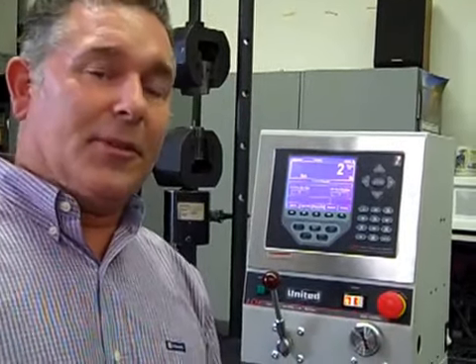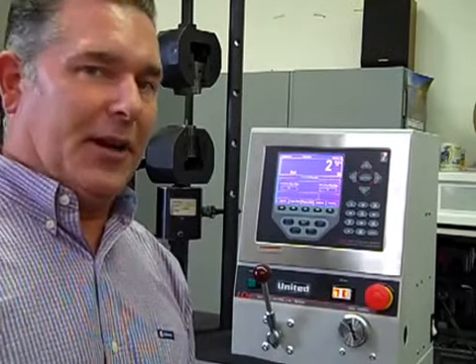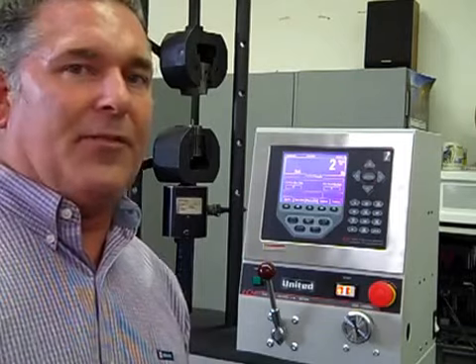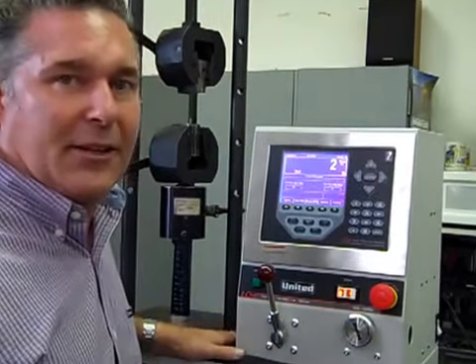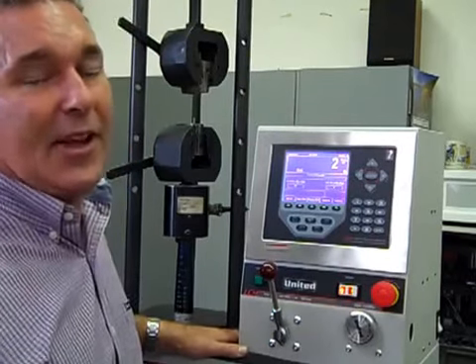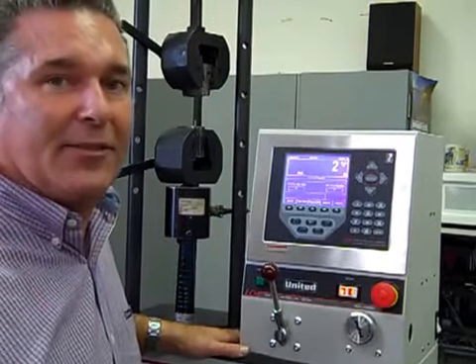Hi, I'm Jeff Routley, sales manager at United Testing Systems Corporation. I'm here to run the LCH series speedy tester manufactured by United. This is a hydraulic, manually controlled machine. It has 150 kN capacity.